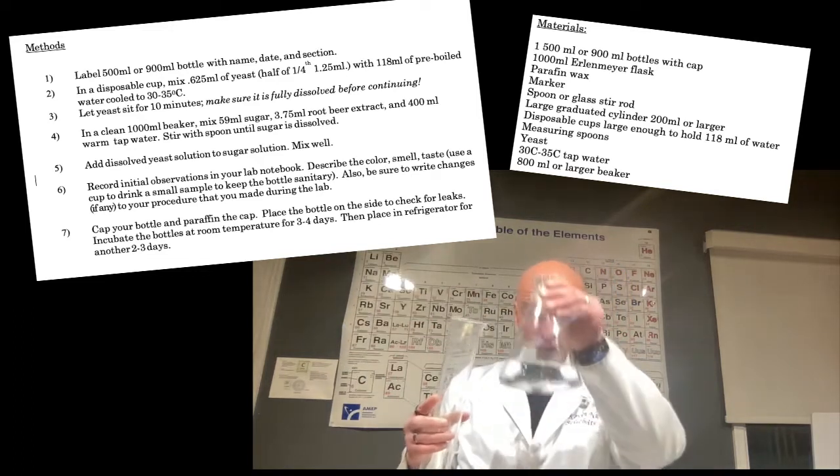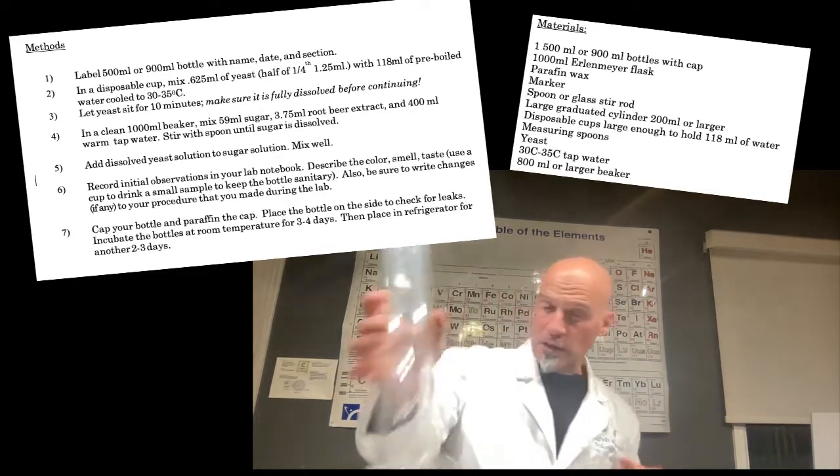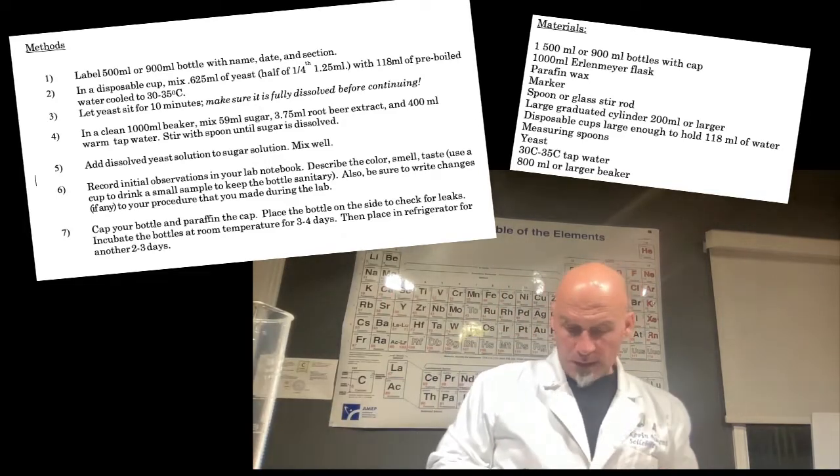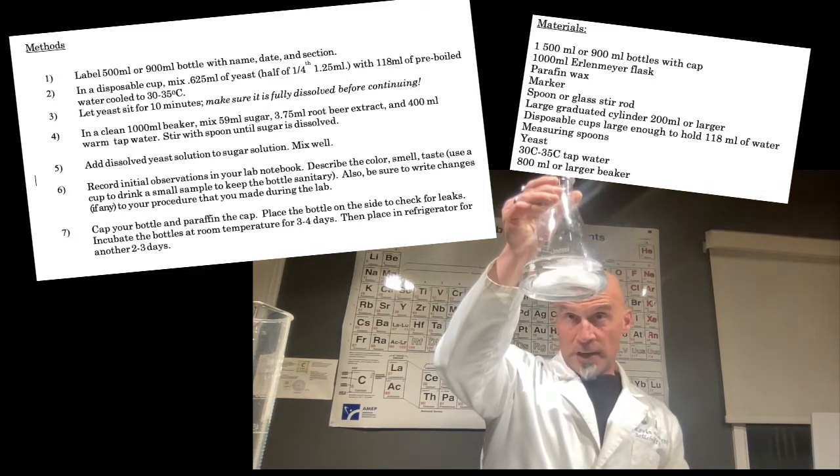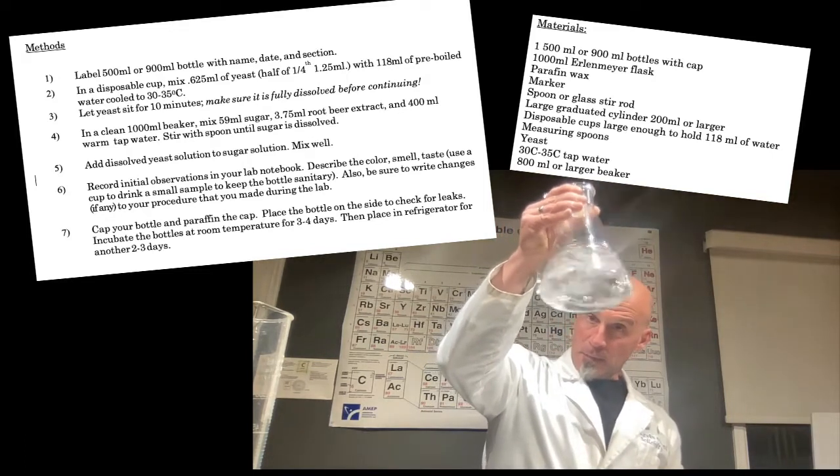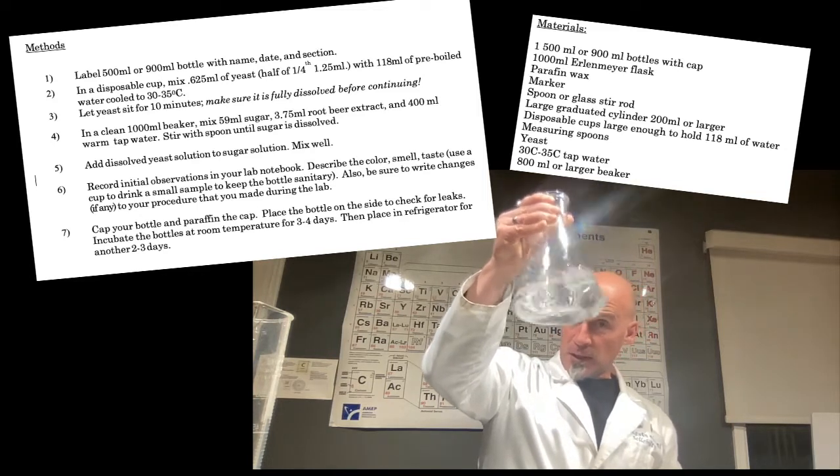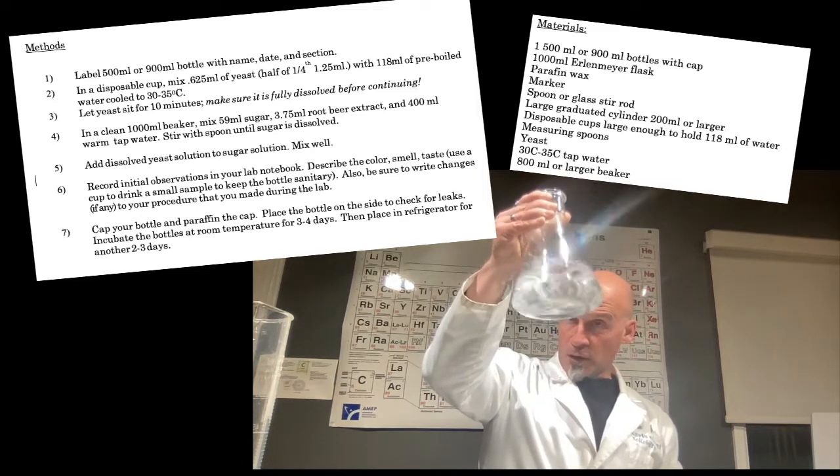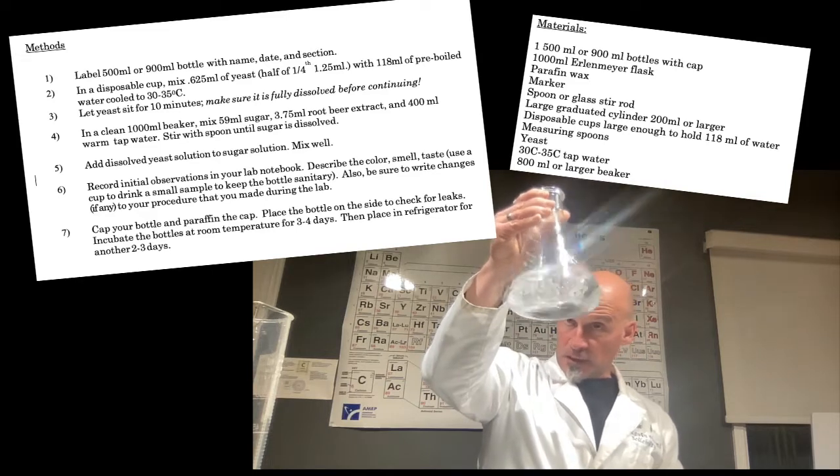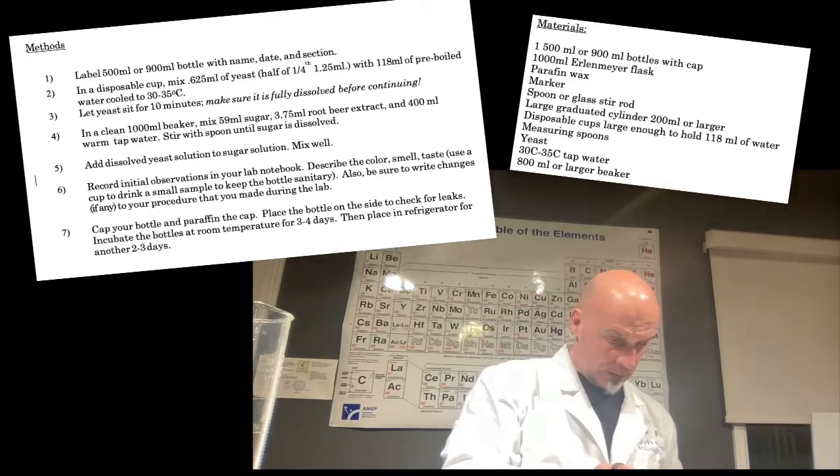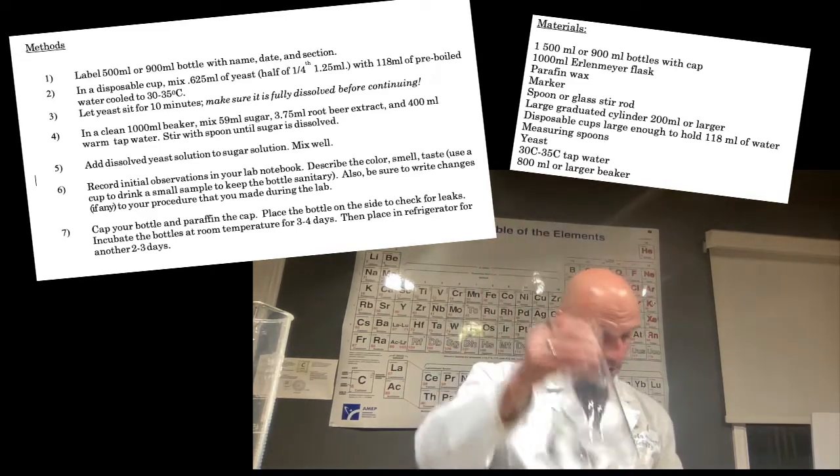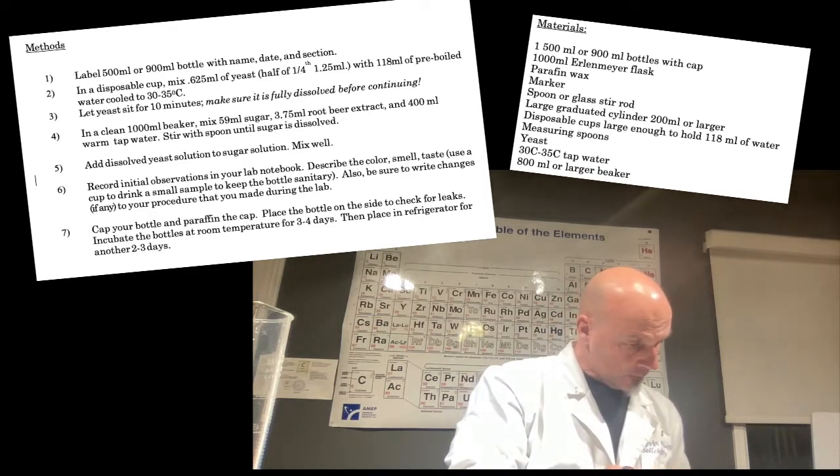And again, you want this actually on the table, just doing that for demonstration. Alright, so now, I've got my sugar, and I've got my root beer extract, and I've got my water. So, you want to make sure and mix that up. You can either agitate it like that, or again, go ahead and use a glass stir rod if you need. Give it a couple shakes like that, and make sure the sugar dissolves, making the solution.